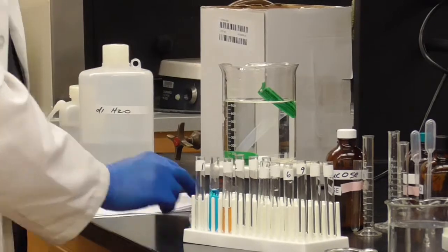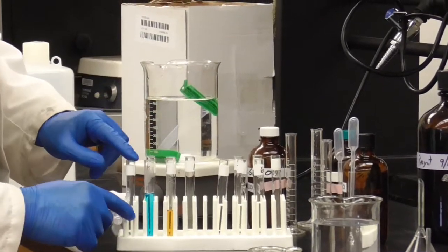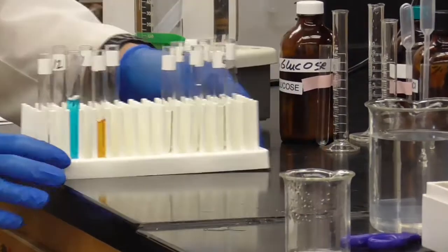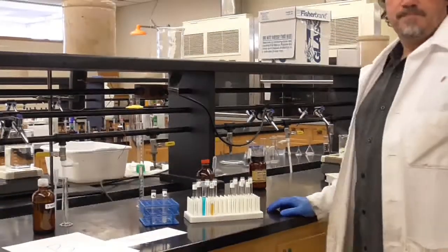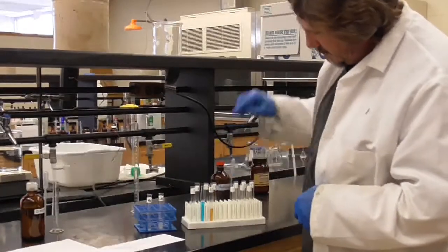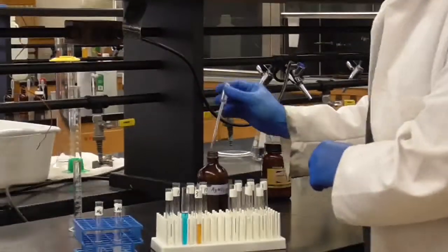Okay. And now, remember, this was from test tubes 1, 2, and 3 for the chloride, the glucose, and the starch test. They were all negative. Now we've got 3 more. Let's go test those. All right, so the first one, we'll do the chloride test using silver nitrate. Put a couple drops there in the first test tube to look for chloride ions.